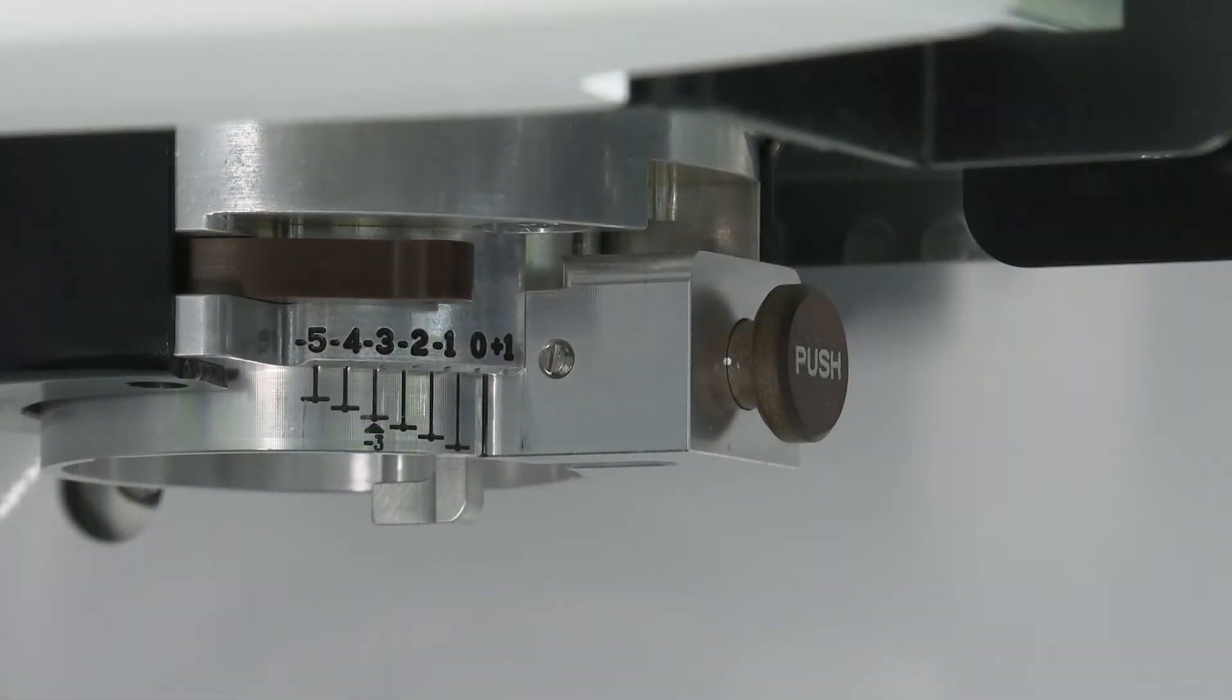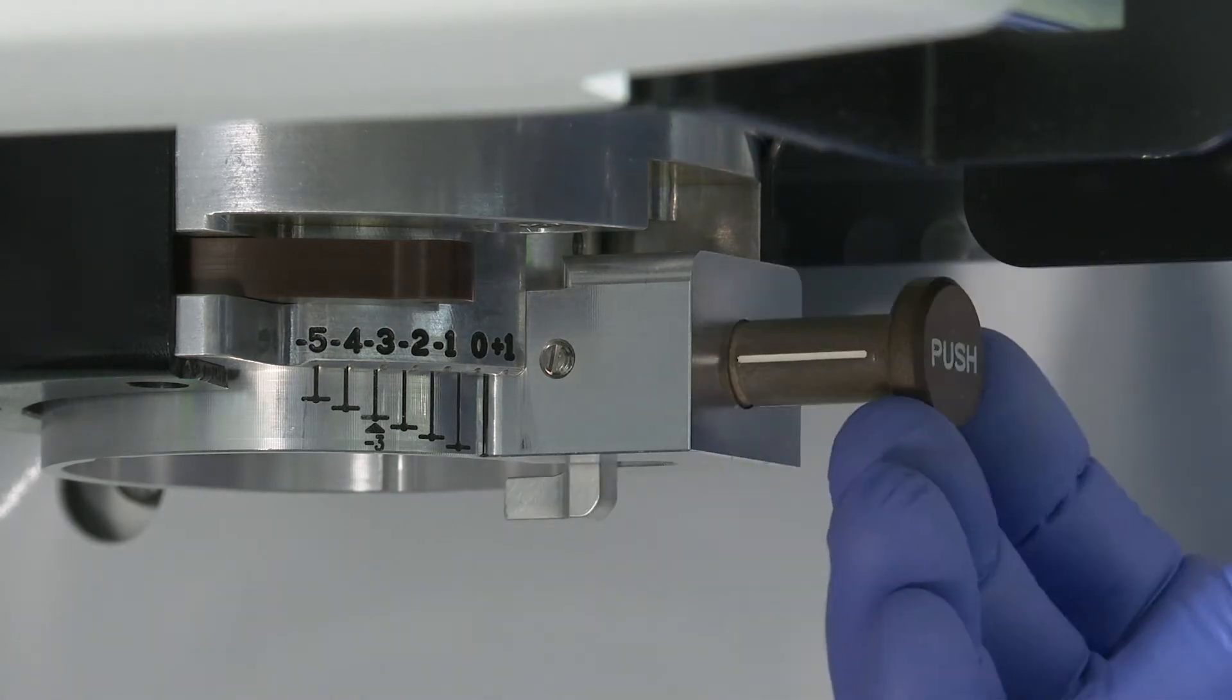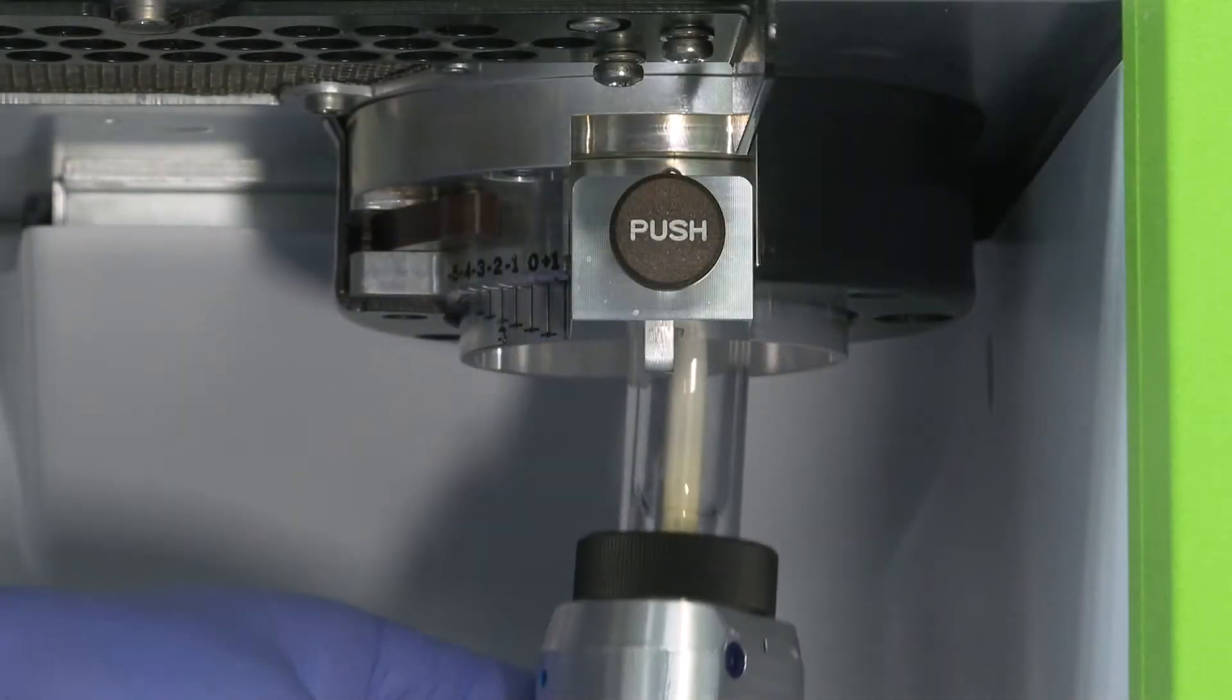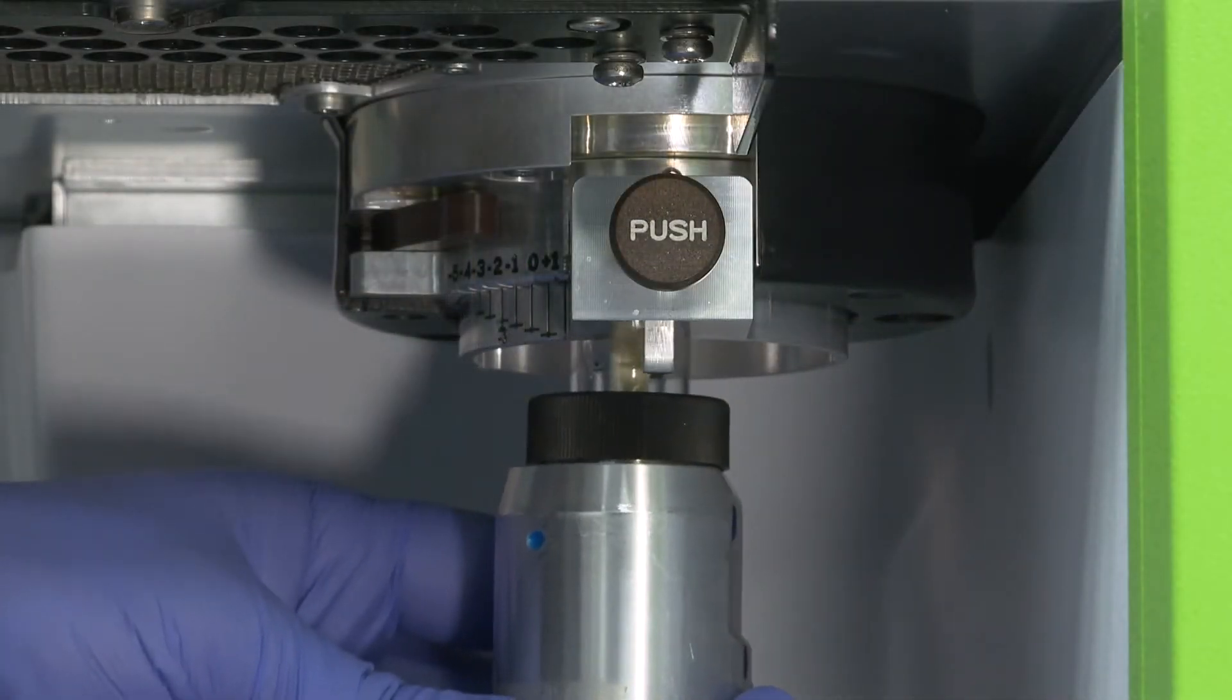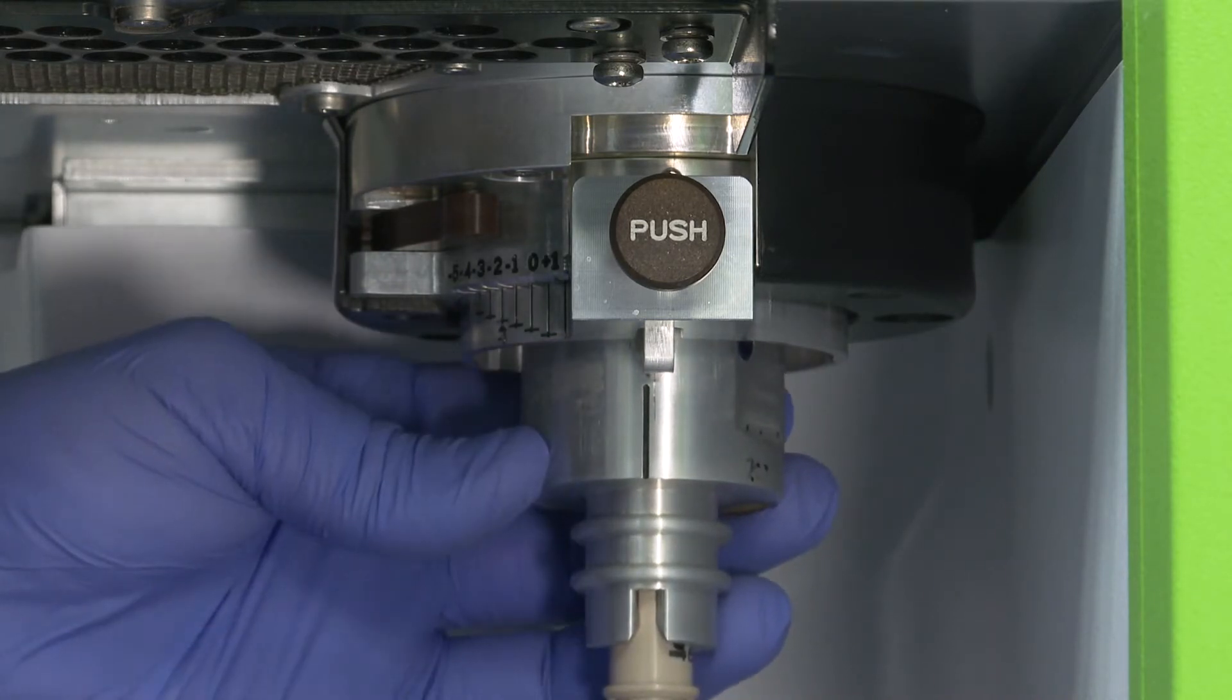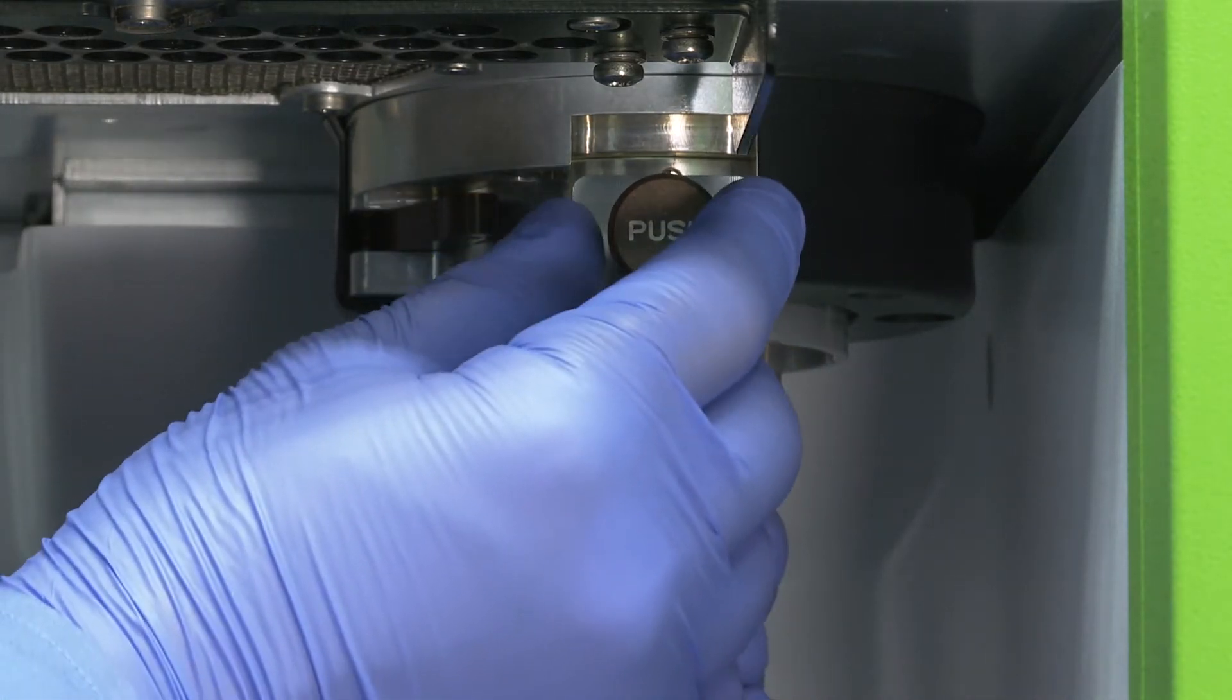Before inserting the torch module into the torch mount, verify that the torch locking pin on the torch mount is pulled fully outward. Rotationally align the torch module so the long vertical alignment line on the torch holder body is centered with the torch locking pin.